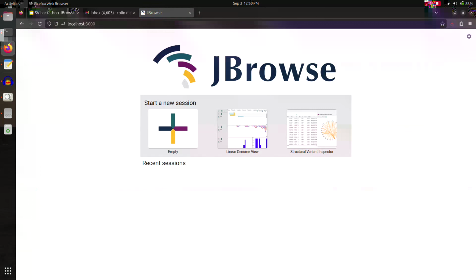And I'll also note, just as a preparation step, I have already indexed this FASTA file with samtools faidx hg19. So again, I did that before that previous command, but we can do it again, forced to override it. Now we can go to the browser again, and it gives us this welcome screen instead of that error message, and we now have hg19 chromosome 22 as the name of our quote-unquote assembly, and chromosome 22 is loaded.